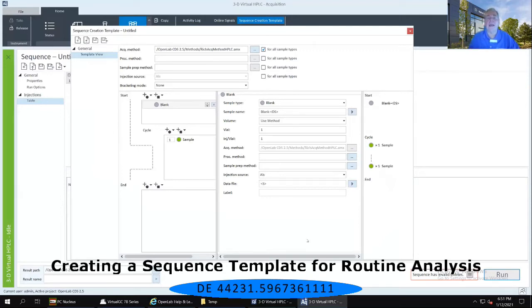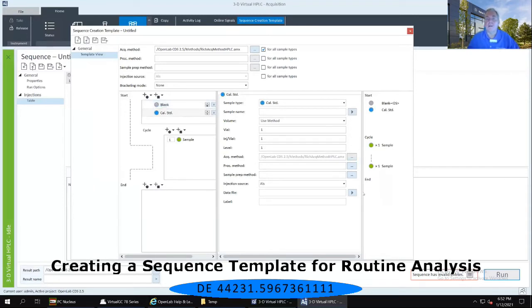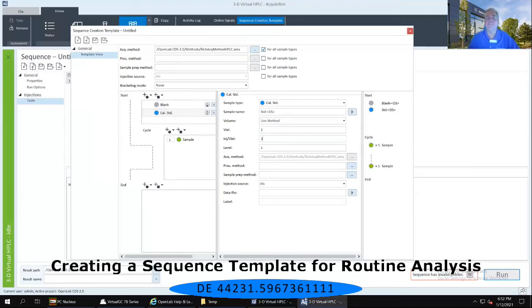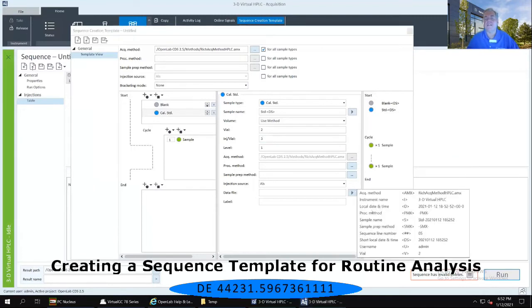According to my SOP, I have to run a triplicate injection of one single level of my calibration standard. On the lower left-hand panel, just to the right of where it says start, I'm going to use that pull-down menu again and select CAL standard, which has a blue icon to the left of it. In the middle panel, I'll fill in STD as the sample name along with a dash, and my right-facing arrow will give the short local date and time. This vial position is going to be number two — since one was already my blank — and I'm going to change the injections per vial from one to three, because it needs to be done in triplicate. Then the right-facing arrow for the data file will select the short local date and time again.